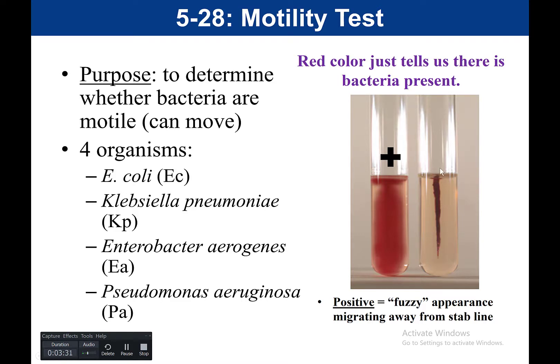In the negative, we just see growth along the stab line — there is no fuzziness, and the bacteria only grew where they were inoculated. That's going to be our negative. Both positive and negative will have growth and you will see red, but it's where the red is that tells us whether it's positive or negative. If it's away from the stab line, that is positive for motility — the bacteria were able to move through the agar. If bacteria are only along the stab line, that is going to be a negative.